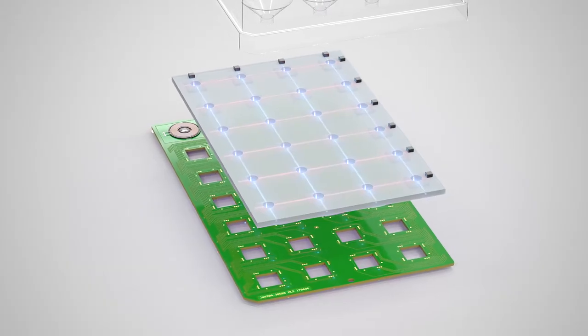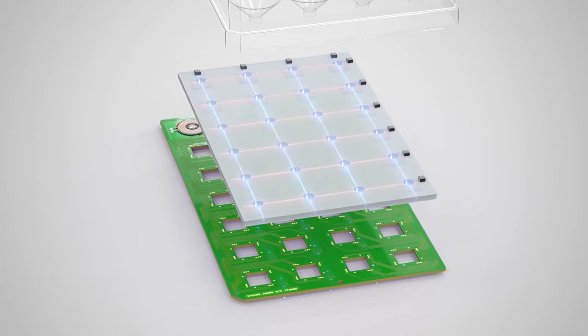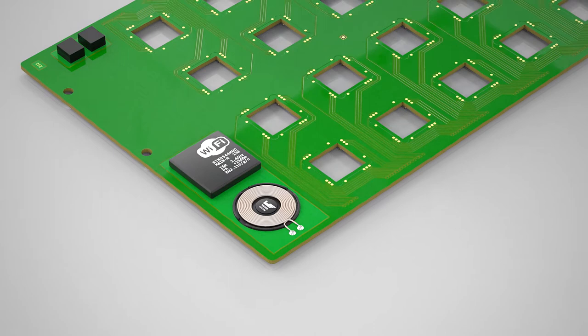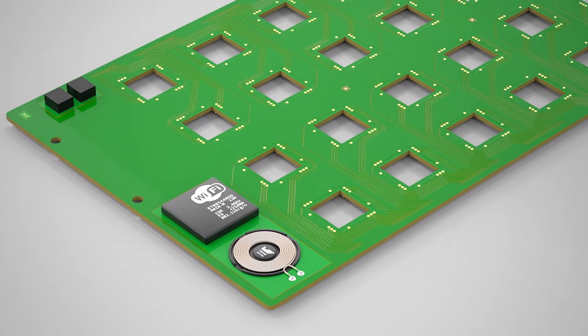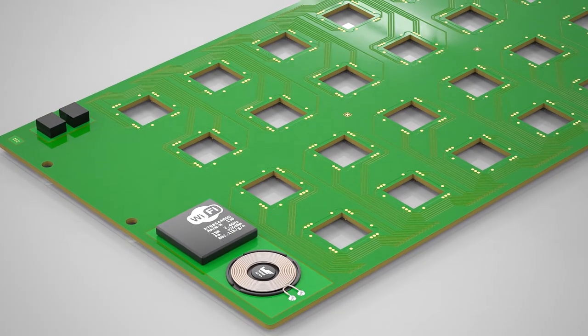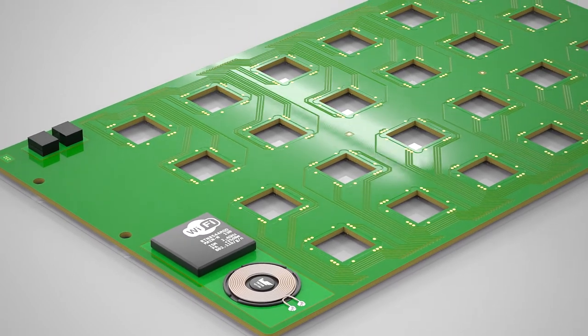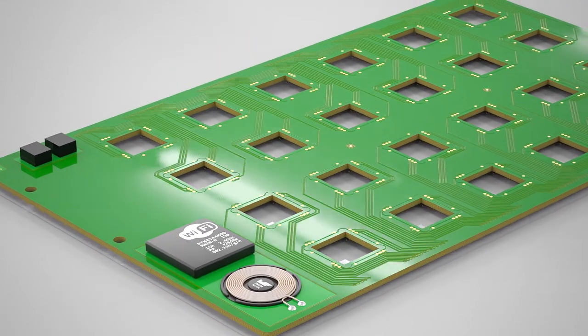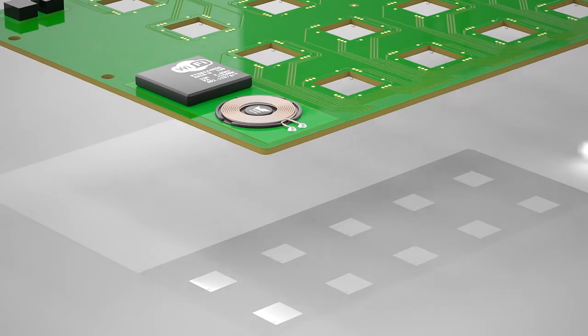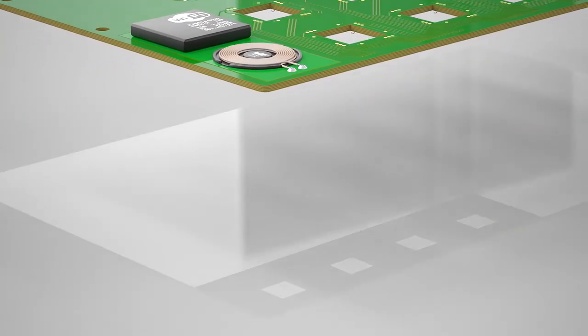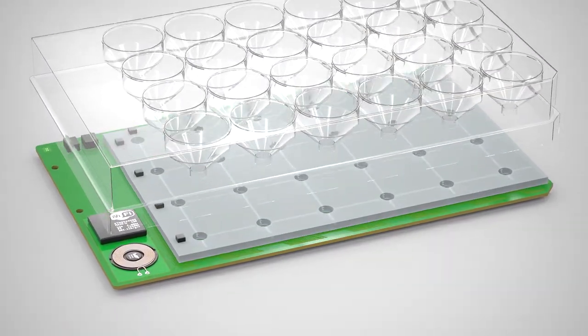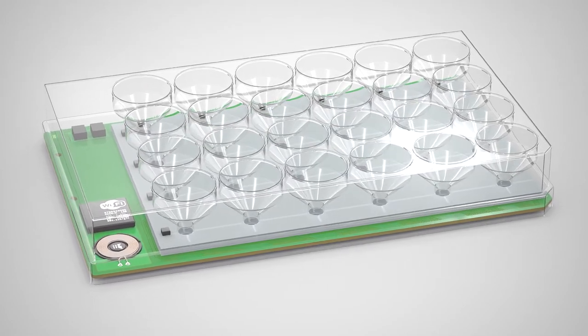The fluid carries nutrients or pharmaceutical agents to the organ-on-chip devices and removes waste products. A printed circuit board contains electric circuitry, wireless connectivity and wireless power control. The transparent bottom cover enables microscopy from below. The whole device is hermetically sealed so that it can be safely used in incubators.